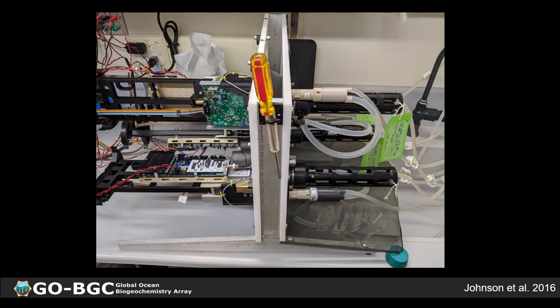This is the setup that we use at MBARI to measure K0, the final step. You can see the deep sea Durafets on the right side, and the seawater. There's a flow cell over the deep sea Durafet that's integrated into the pump of the CTD. The CTD pump is circulating seawater into a common carboy, which is not shown in this picture. The same vat of seawater is circulating between multiple deep sea Durafets, so that we can calibrate multiple sensors at a time. Periodically we take discrete samples and measure pH spectrophotometrically to quantify what the solution pH is, which we need to calculate K0.